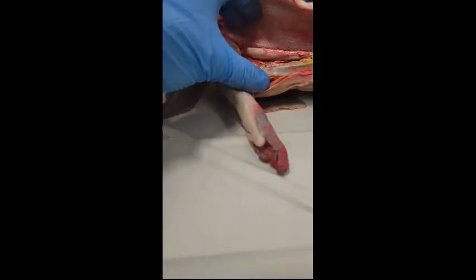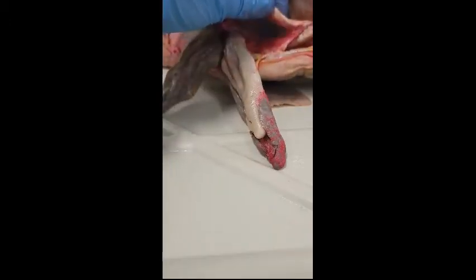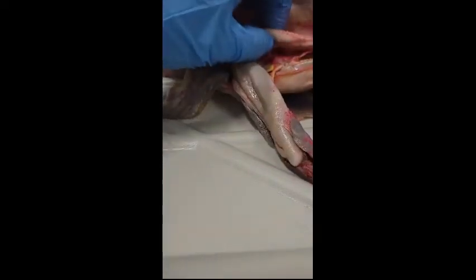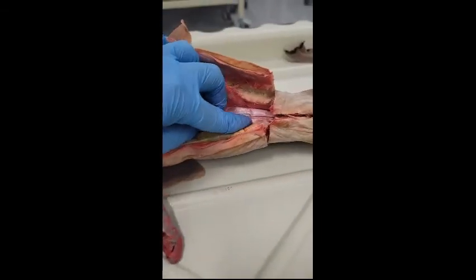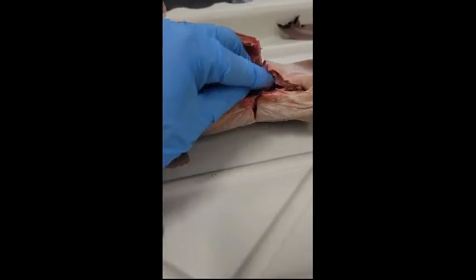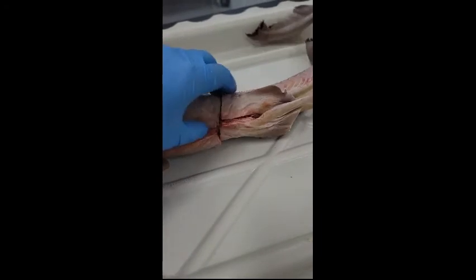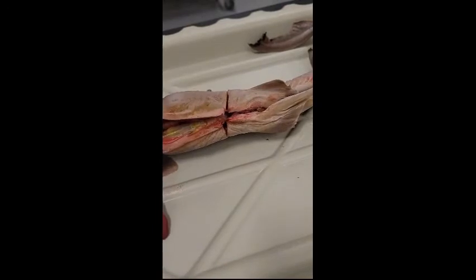In the male, the primary sex organ is the testes, seen here, which are supported by the mesorchium, which you can see here. Sperm are conveyed from the testes and move down to the seminal vesicle right here, which terminates in the sperm sac, which is bilobed right here, and engage in reproduction, releasing the sperm into the female.